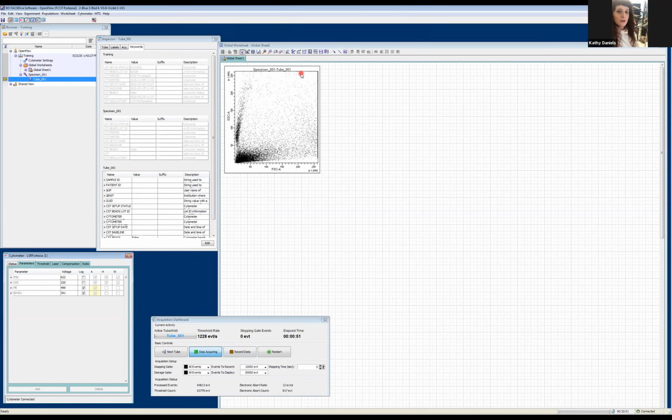For anyone that's used to looking at flow cytometry data, when we're looking at cells, typically we want them somewhat in the middle of the scale. It's going to depend on the cell types that you're working with. But I want my cytometry cells to be somewhat right about here, if you can see my mouse. A nice tool to get an idea of whether your cells are on scale or off scale is to start setting some gates and have an idea of what the population percentages are and what percentage is off scale or on scale.